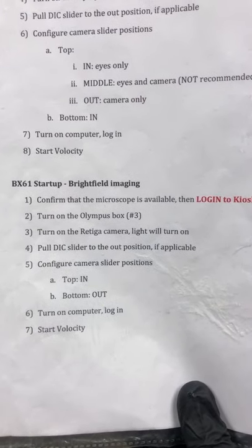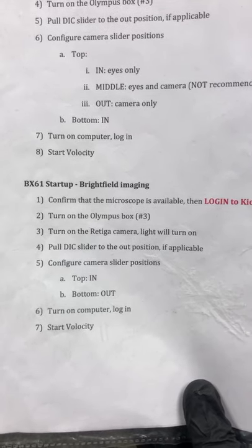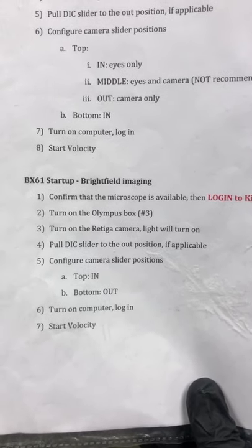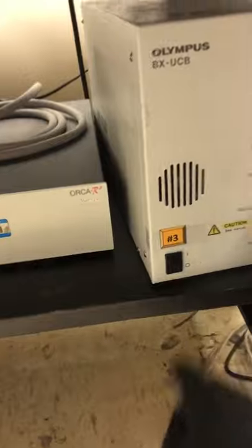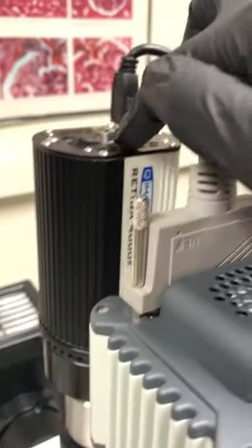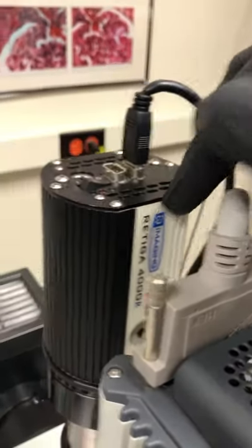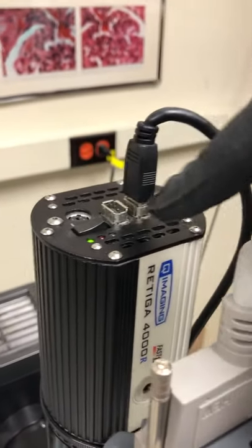Confirm that the microscope is available, then log into the kiosk — I just did that off camera. Turn on the Olympus box, that's item number three, which is down here — you can see the number three. That's on. Then turn on the Retiga camera. We turn the light on by pressing this button and turn the camera on by pressing that button. You can see the light that indicates it's on.